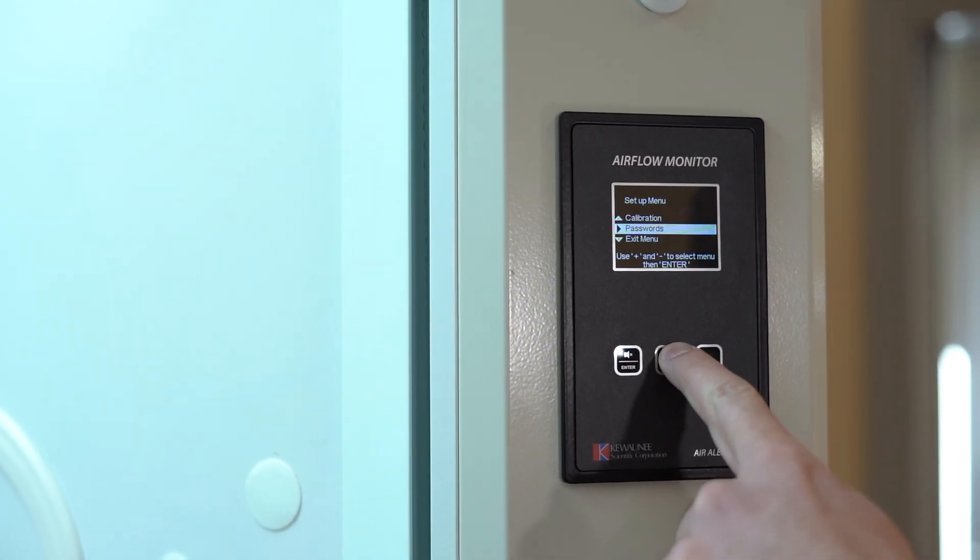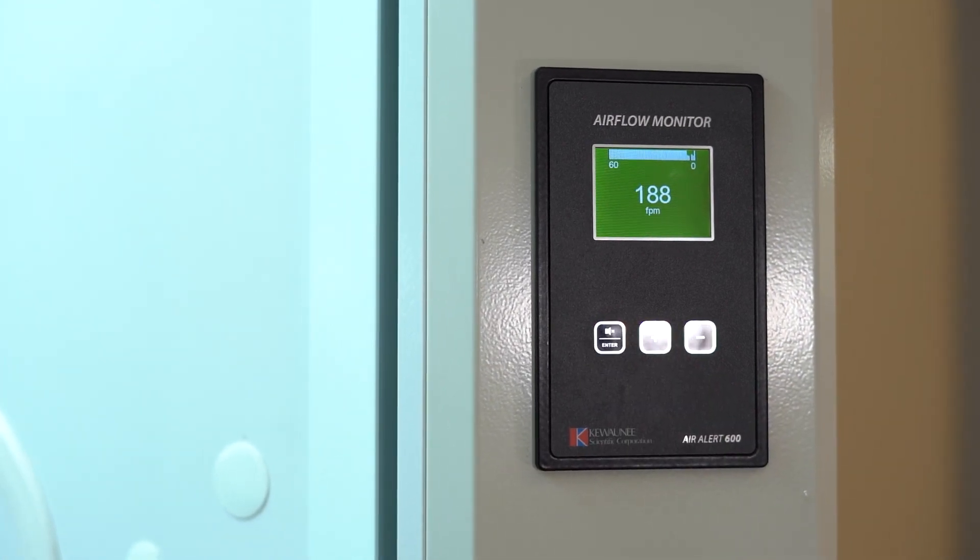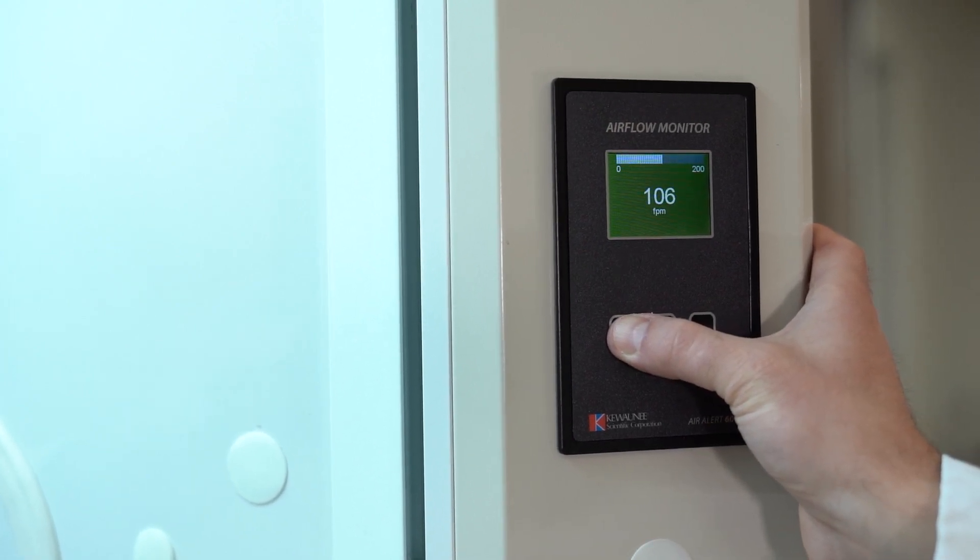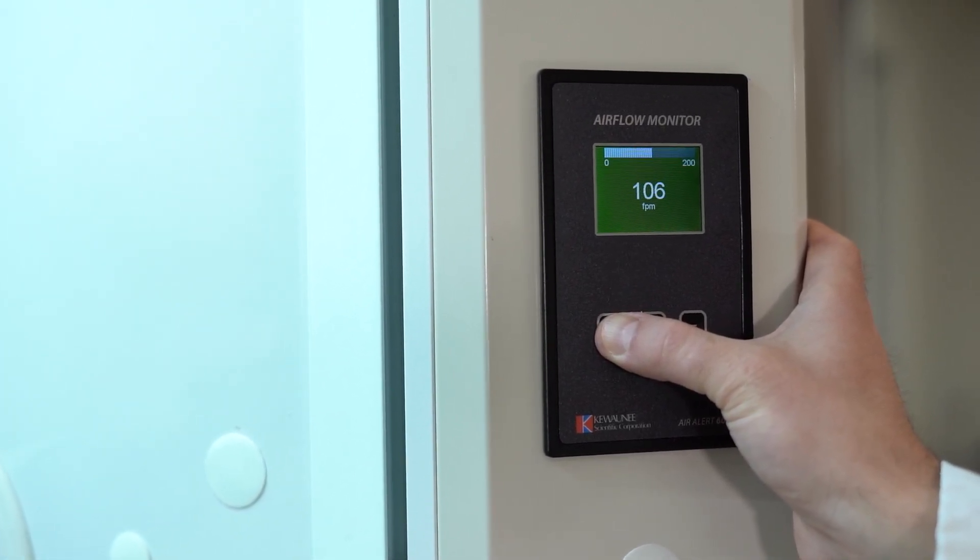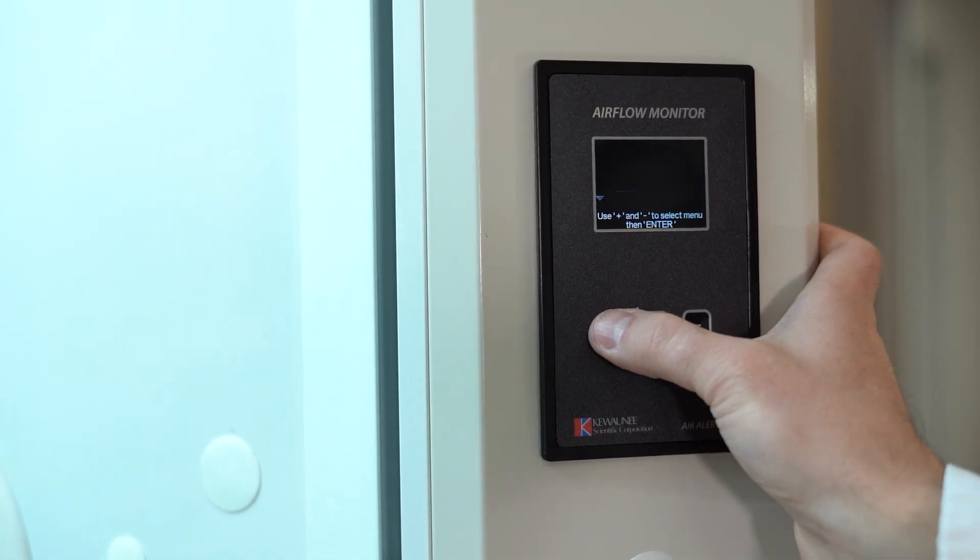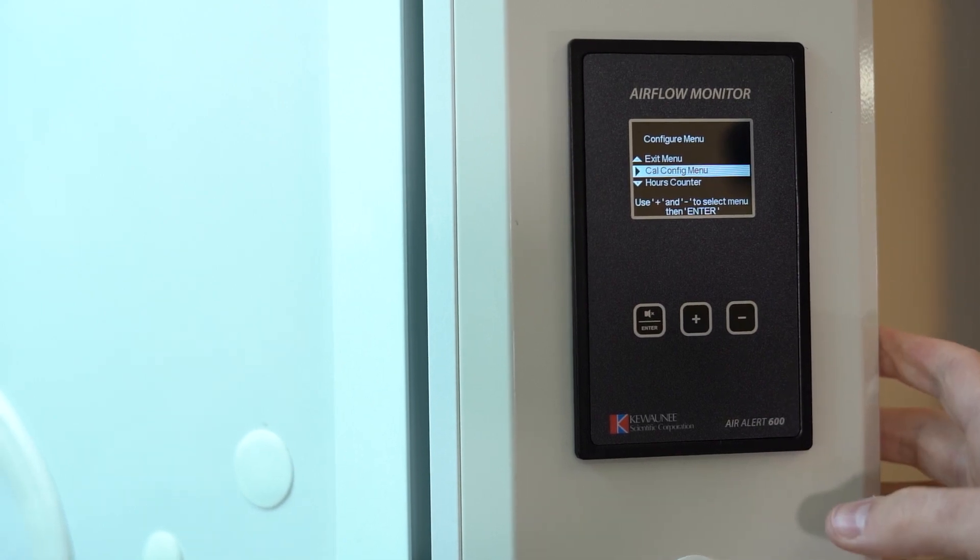Back out of the menus and select run in the main menu. Another common change is the face velocity set points for safe, warning, and fail states. These are found under the configure menu and the submenu called calconfig.